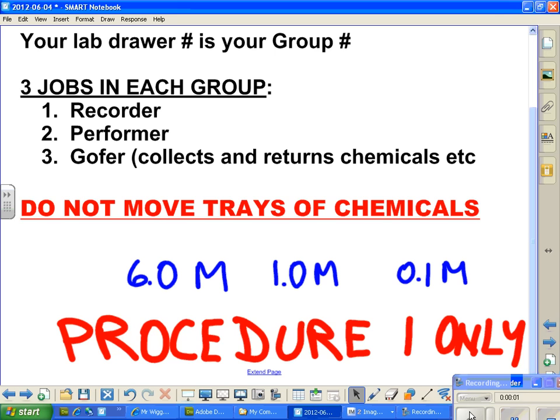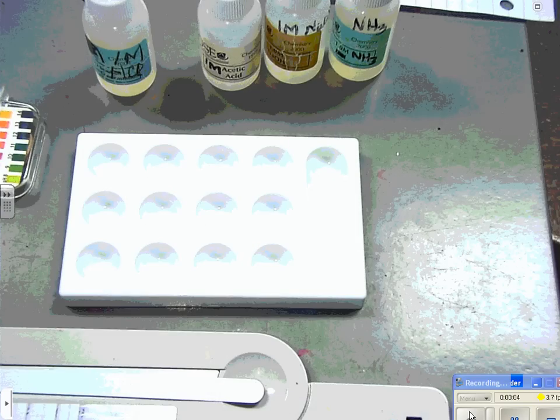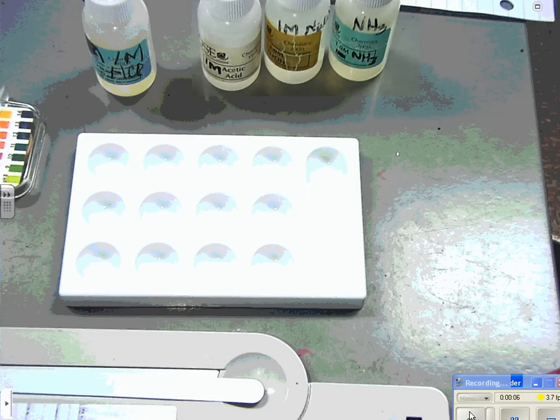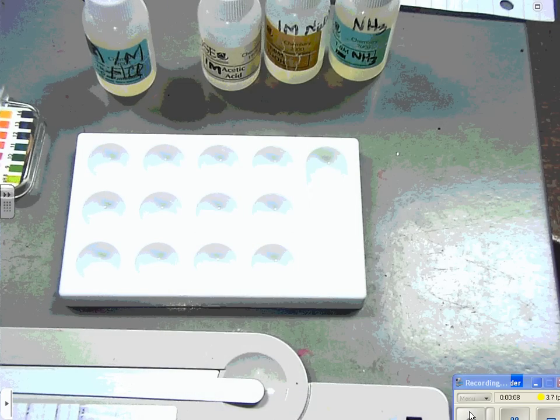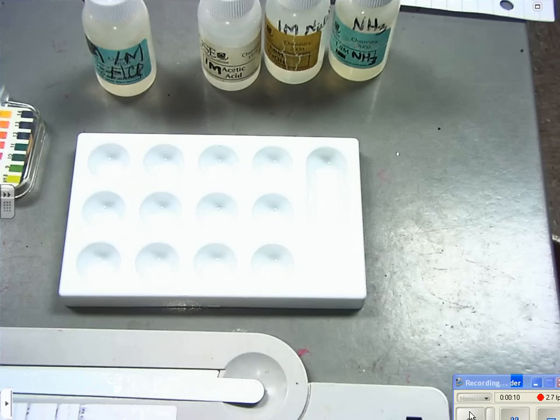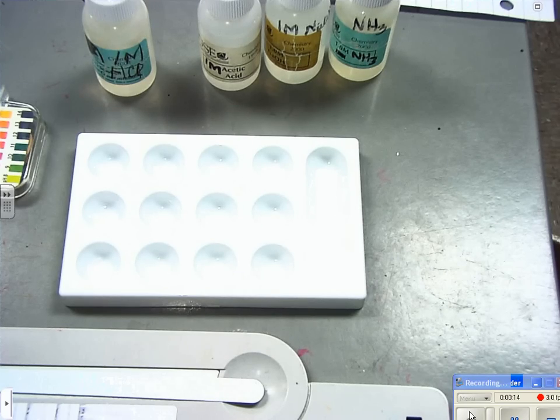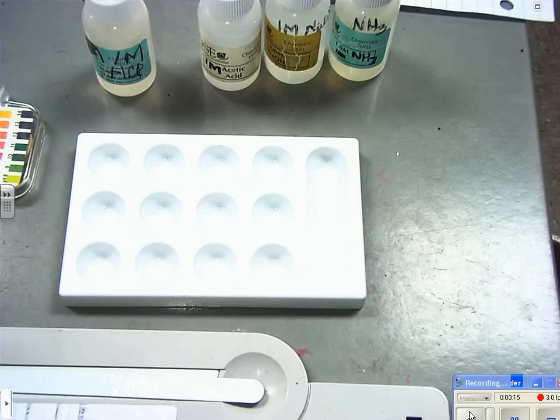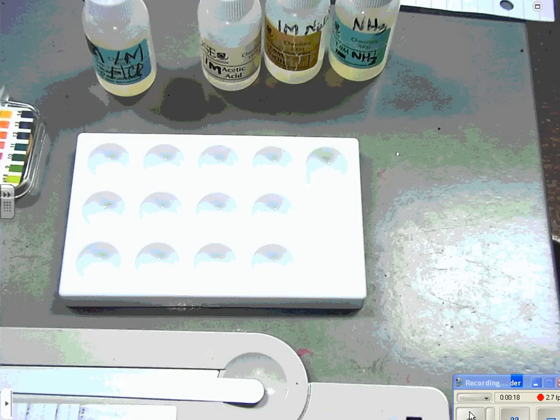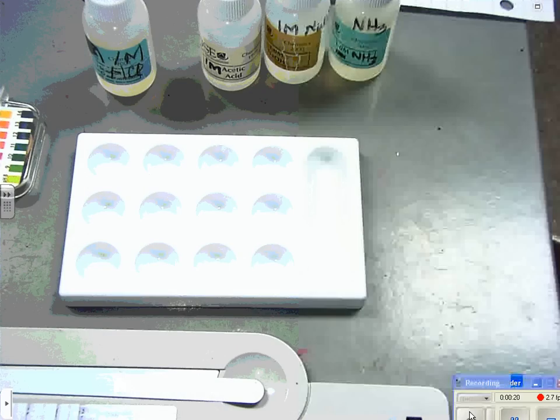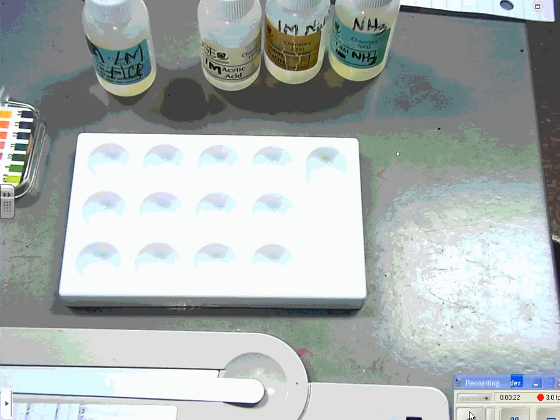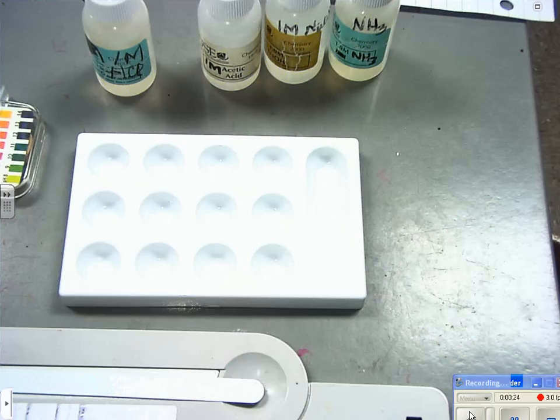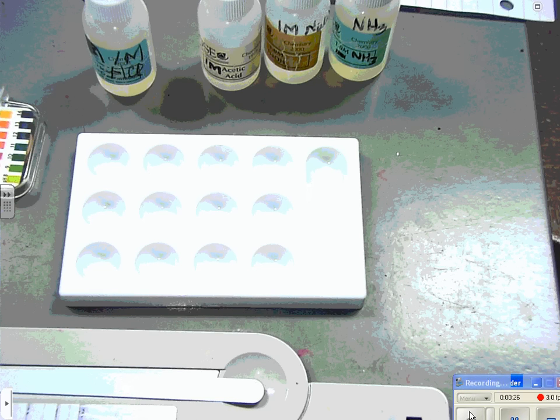We're doing procedure one of the acid-base lab and a student is going to demonstrate. We have hydrochloric acid as one molar, acetic acid as one molar, one molar sodium hydroxide, and one molar ammonia. Our student Jacob is going to tell you all about what he does as he does it.